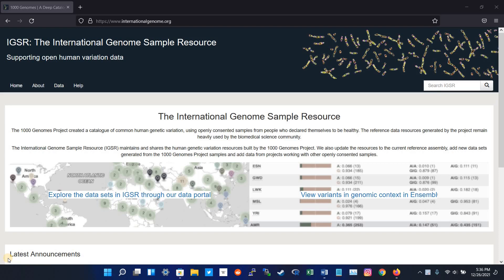The final dataset contains data for 2,500 individuals from 26 populations. All data for the Thousand Genome Project are freely available.